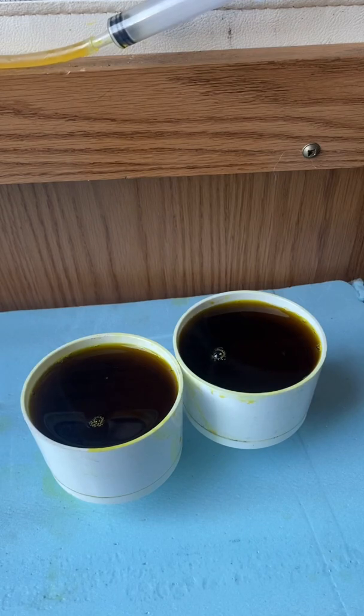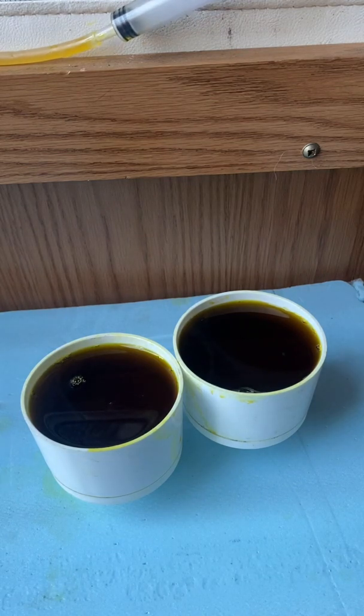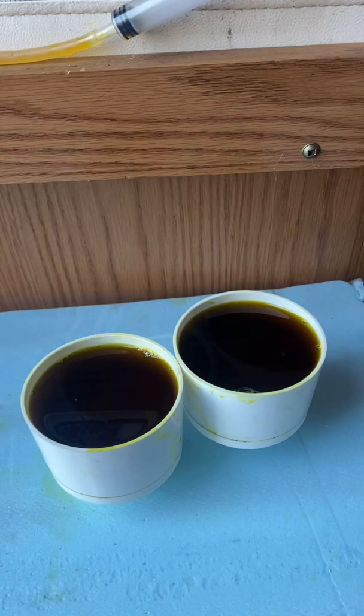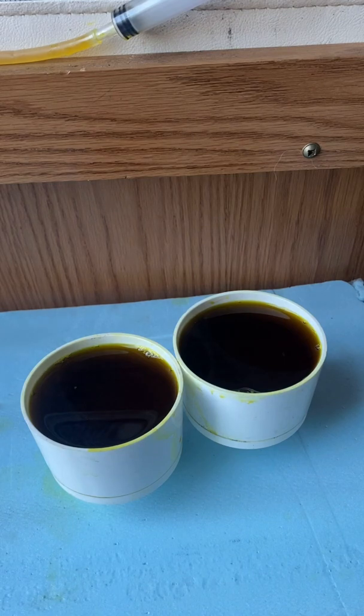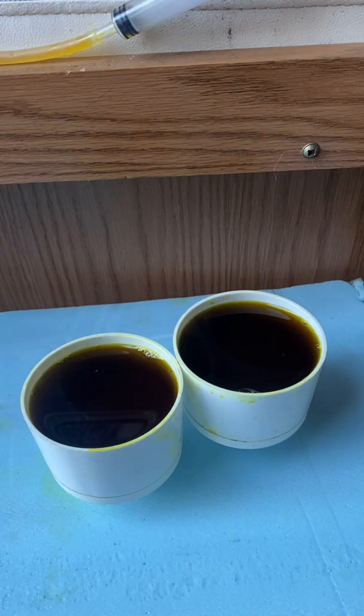Now you can see how slow they're going. Filter now — our platinum solution, literally dripping. That's why I got two. I wish I had a third filter; I would have had that on there as well.